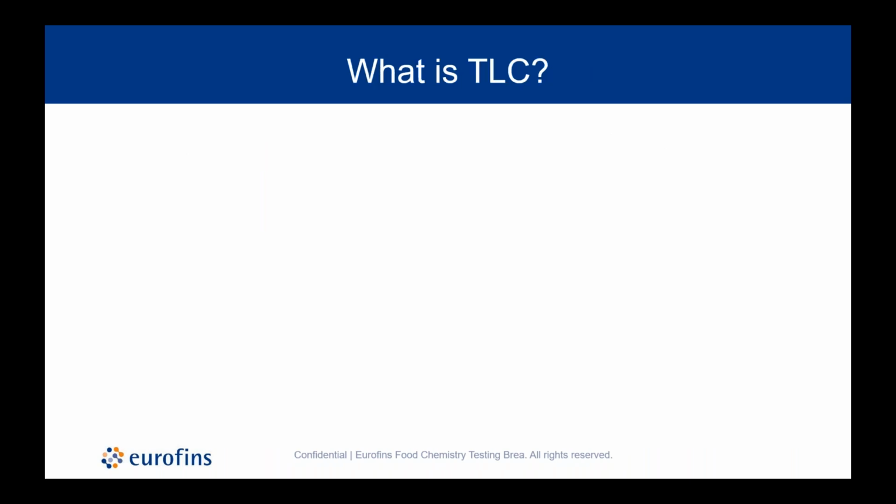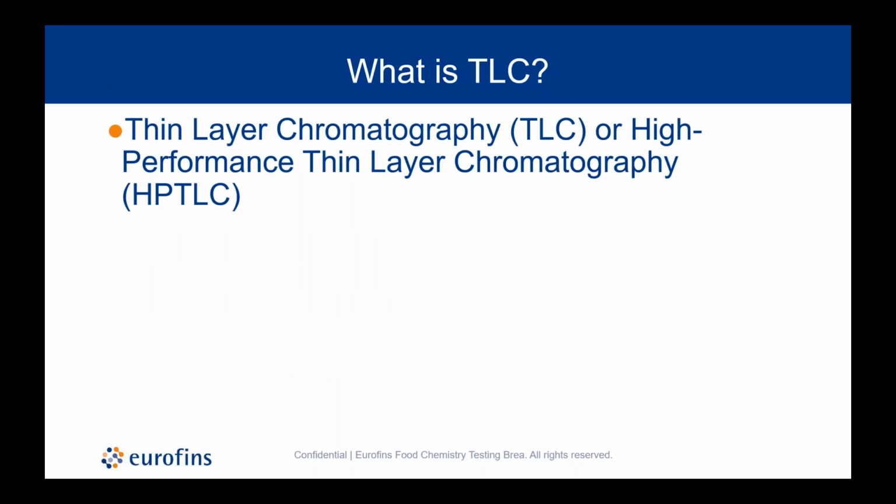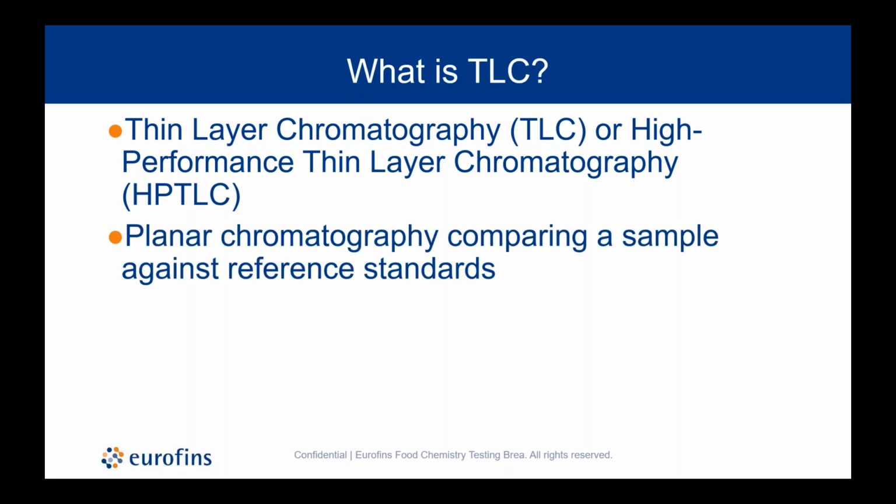So what is TLC? Thin layer chromatography. That's what TLC stands for. It's also known as HPTLC, which is high performance using instrumentation.